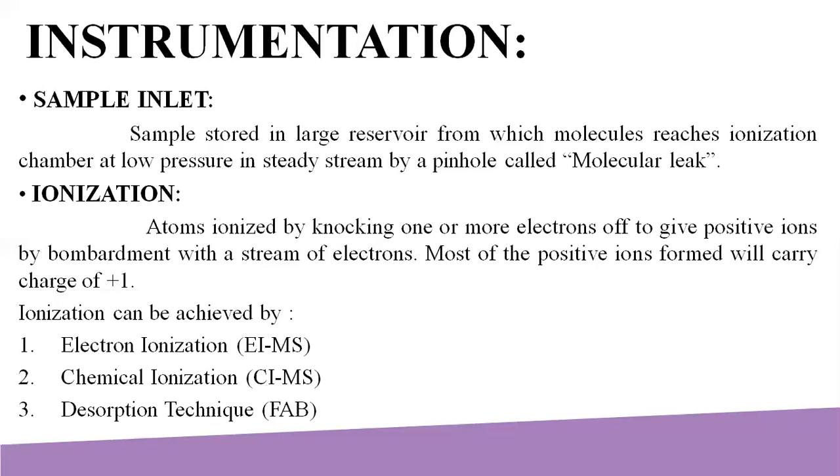Ionization can be achieved by electron ionization, EIMS, chemical ionization, CIMS, and the last one is the desorption technique, FAB.